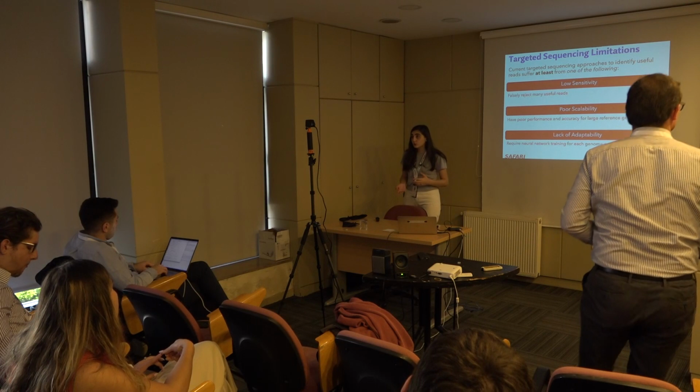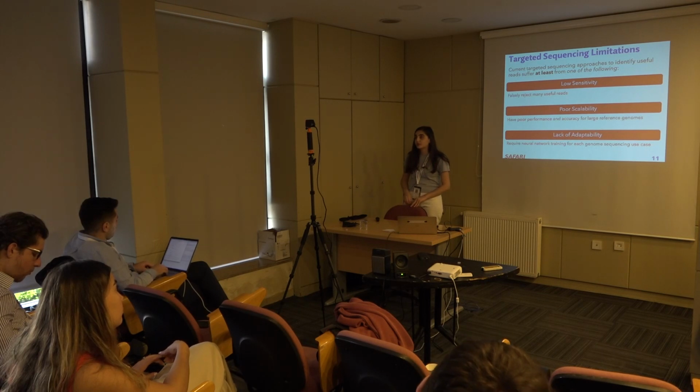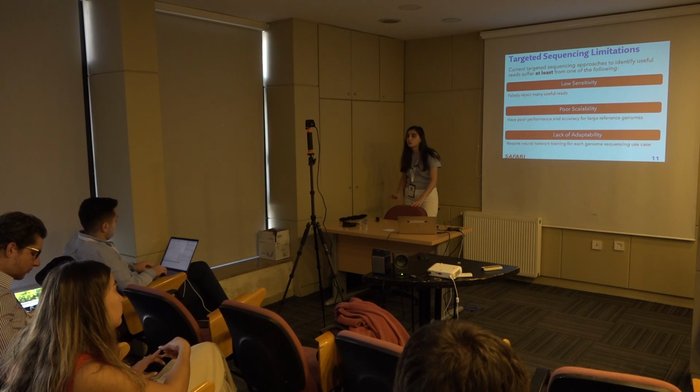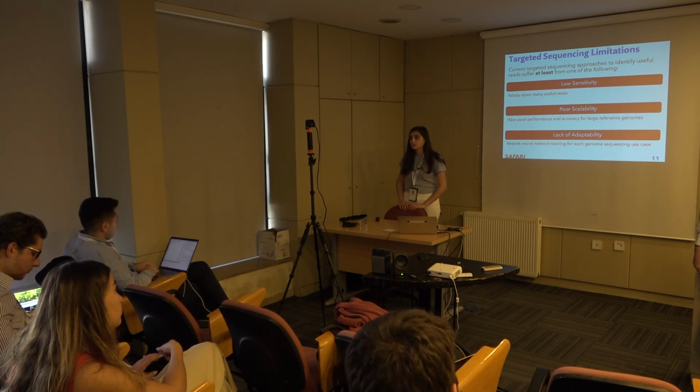But in terms of throughput, yes, LightCall matches the throughput of, and actually exceeds significantly the throughput of, the sequencing machine. So if you have a correct similarity check module, there's no reason why you cannot use LightCall for real-time analysis.